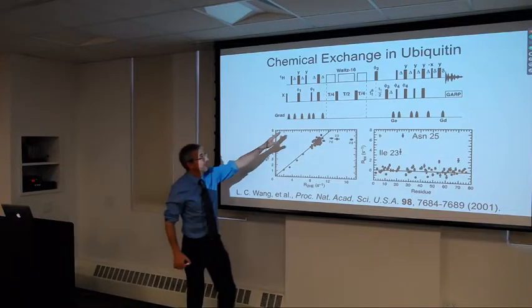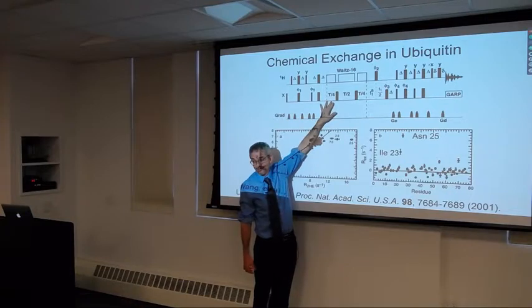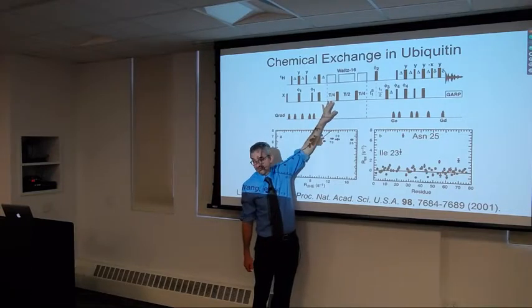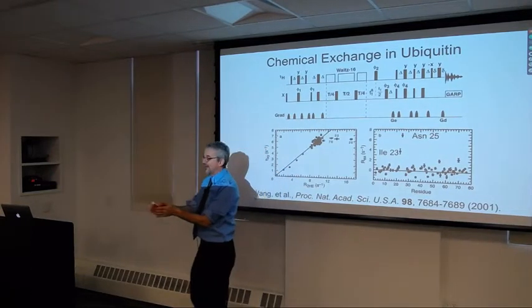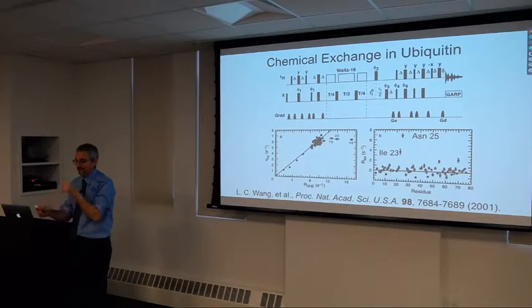So we're just going to do this experiment with two values of T, 0 and some large number, so that we're not pulsing quickly. But if T is large, we're going to have a lot of evolution of the J coupling before it gets refocused.